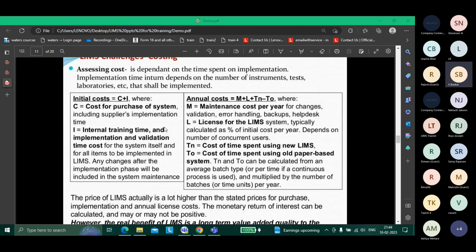Sir, mainly I want to know, will you cover these things like analysis mapping, master creation, compilation mapping for summary report generation? Will you cover this in this session? Analysis mapping, I'm not sure of, but how to build a product, that table, then analysis, yes, I'll cover. Analysis mapping is something which I'm not sure about, what you are telling.